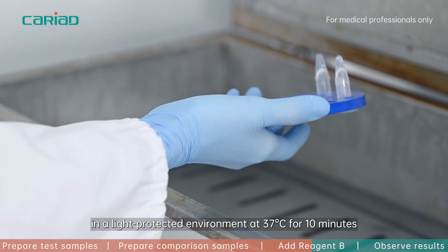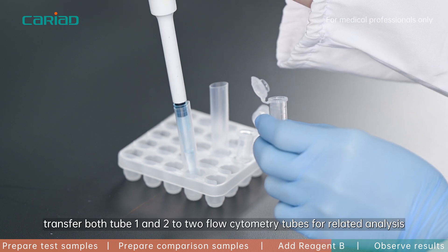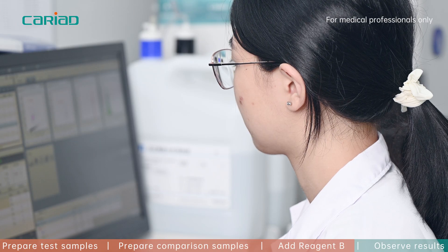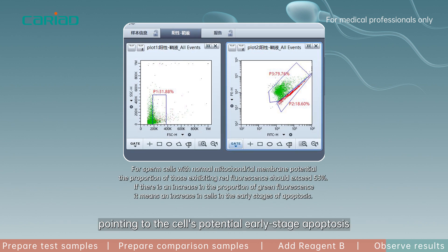After incubation, transfer both tube one and two to two flow cytometry tubes for related analysis. Green fluorescence indicates a decline in mitochondrial membrane potential, pointing to early-stage apoptosis in the cells.